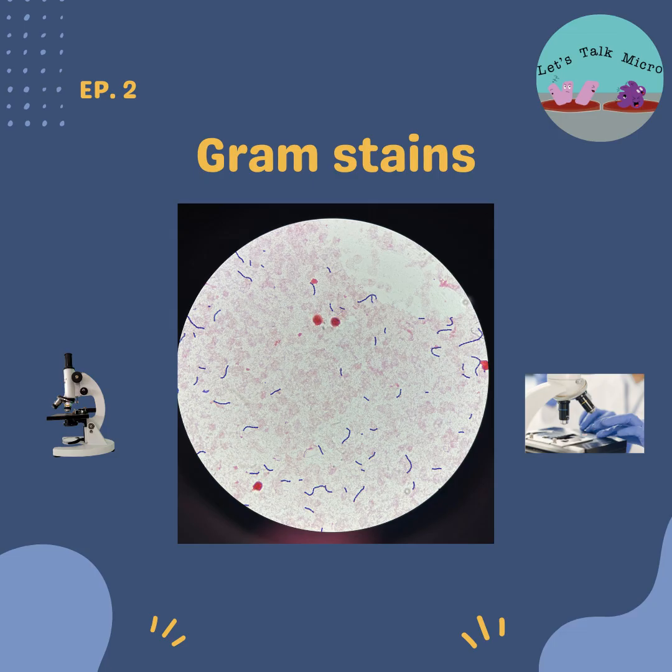Others might not. So if you receive a swab in the lab, you swab the first quadrant of your agar, and then you streak it using the techniques that we mentioned in the last episode. And if you have a swab with liquid, nowadays we have the eSwabs, which have this Amies media, you can do two things. You can either swab the slide, or you can vortex that sample to make sure that all the organisms fall into the liquid, and then you can add a drop to your slide and make your smear that way.